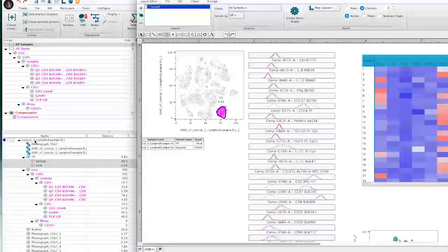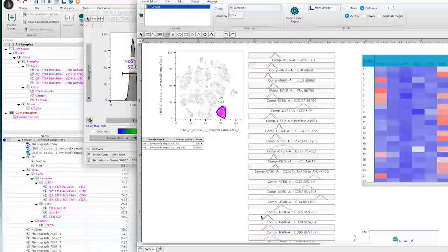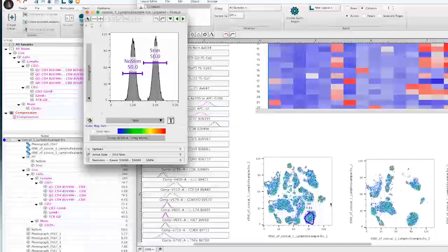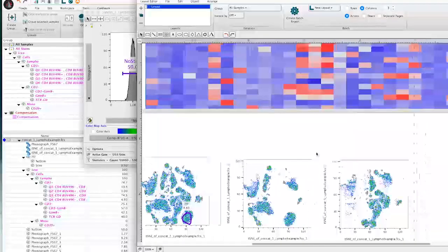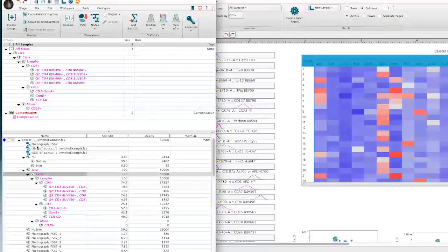You need to, again, concatenate and merge those samples together so you have a way to classify all events with the clustering approach and position all events within the same dimensionally reduced embedding. Then you can actually gate apart the different conditions and compare them visually with the dimensionality reduction space, or numerically, statistically, by taking what you put in and seeing how the output comes out in terms of what clusters and how they're distributed across your experiment.